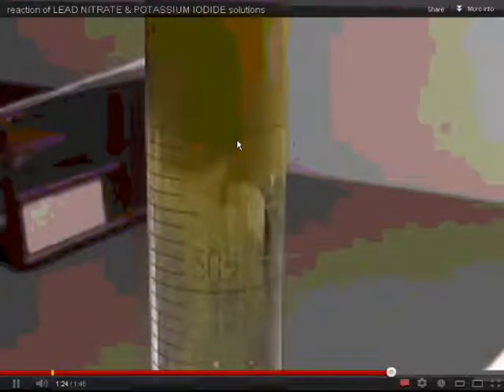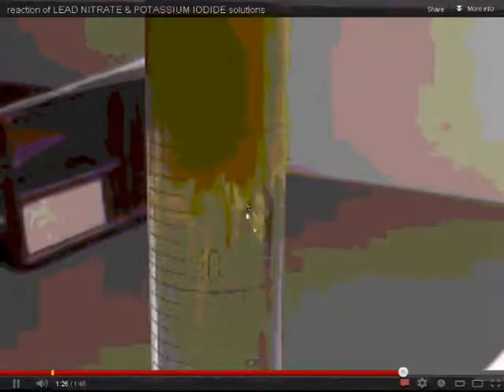I think he's going to pour in a bunch more in this section. Now you're going to have a bunch more reaction. You see what's happening is that these solid particles are going to filter and drop to the bottom. Alright, so that's just a little video on precipitate to give you a better idea. It's when you take liquids, put them together, and you form a solid. Let's go back to our presentation and finish it up with the last few slides.